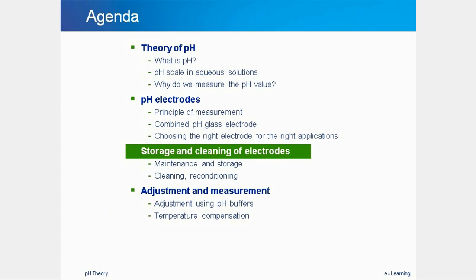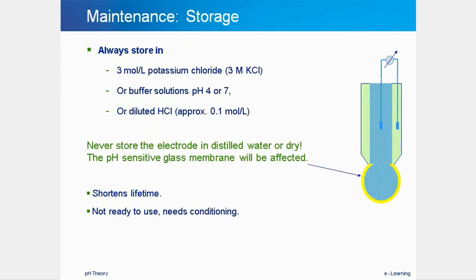After the general theory and composition of the pH measurement electrodes, we now have a look at how to treat these sensors which can measure the pH value of a sample.